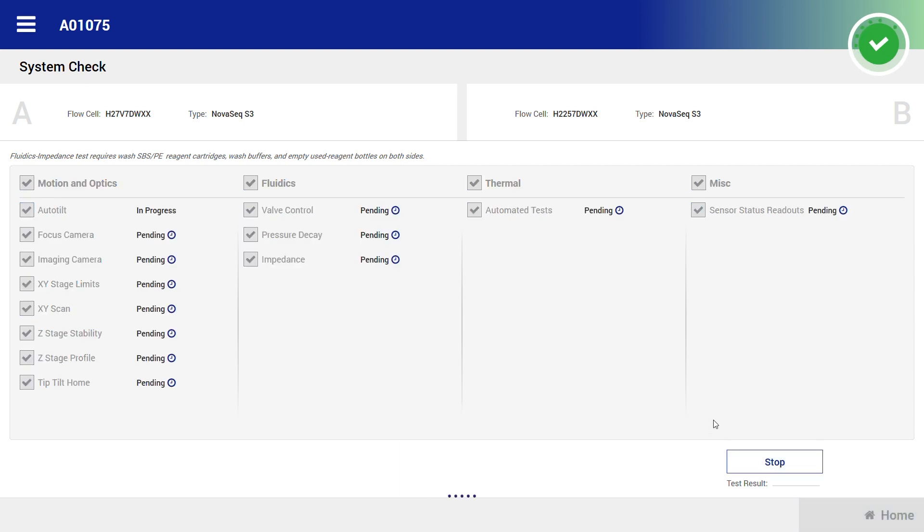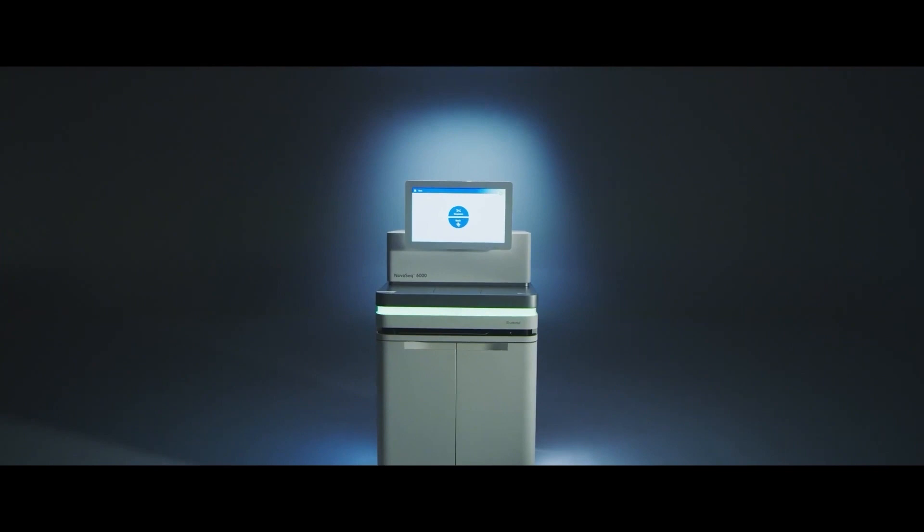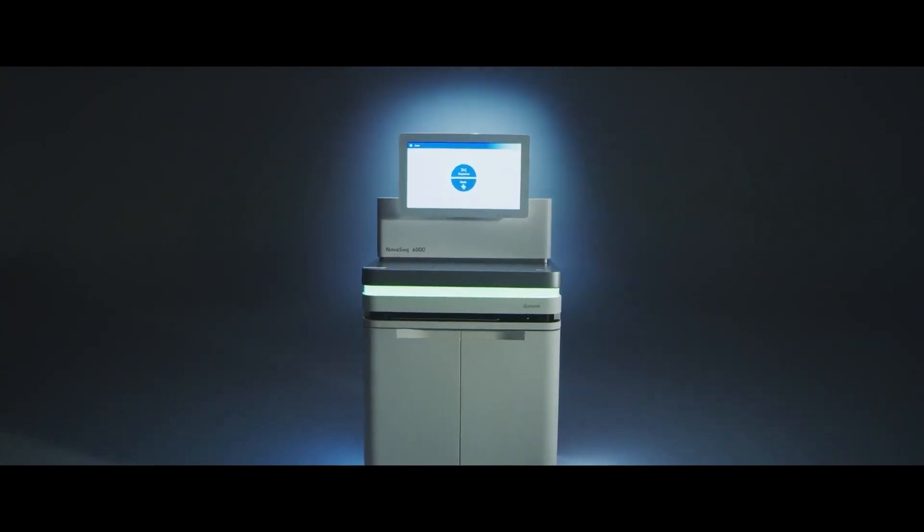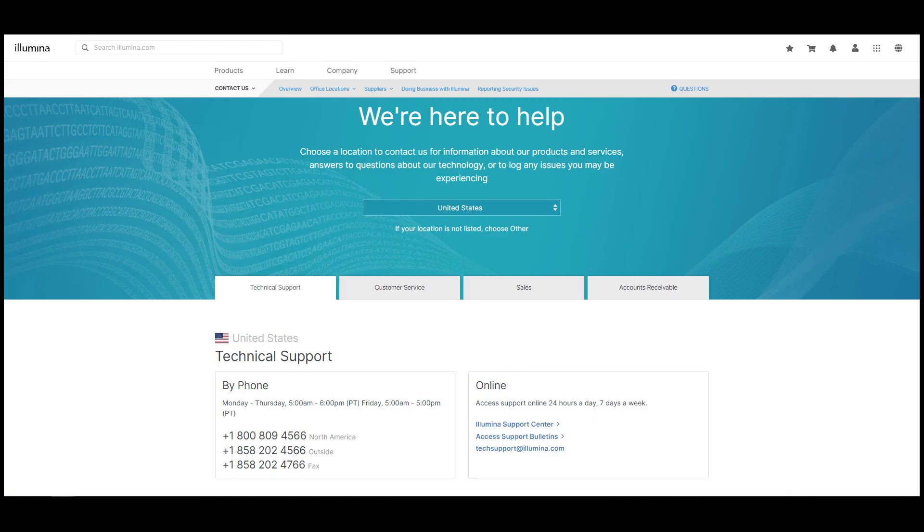The results will be presented as pass or fail. If the tests pass, the instrument is performing according to specifications and you can proceed with the next sequencing run. If any of the tests fail, contact technical support for assistance.